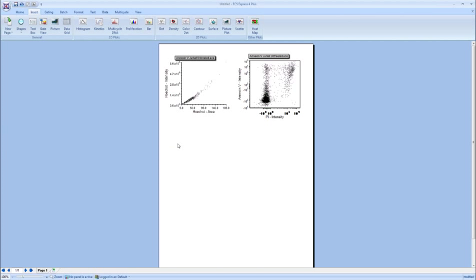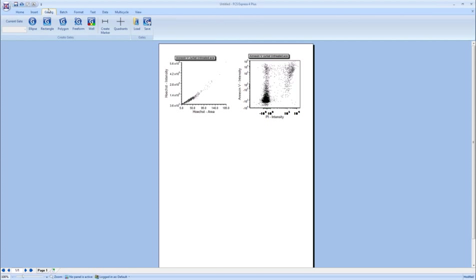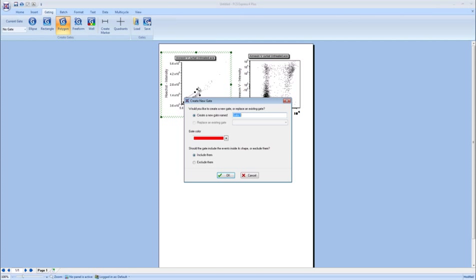So one thing that you're used to doing in the Chemometec software is setting up some gates, and let me show you how we can do that. We have a gating tab up here. We have all these familiar types of gates. If we wanted to, say, create a polygon gate, and maybe just look at some of these healthy cells here, and click OK.